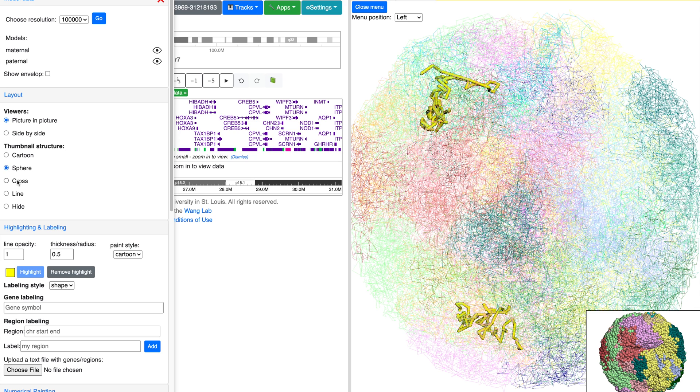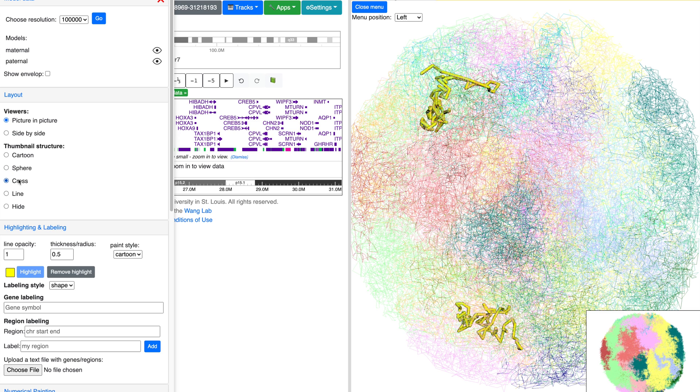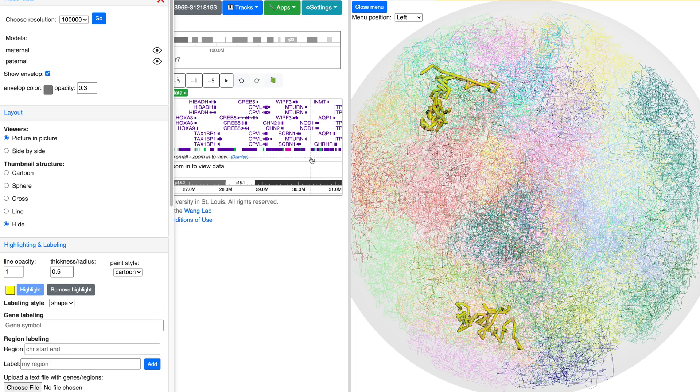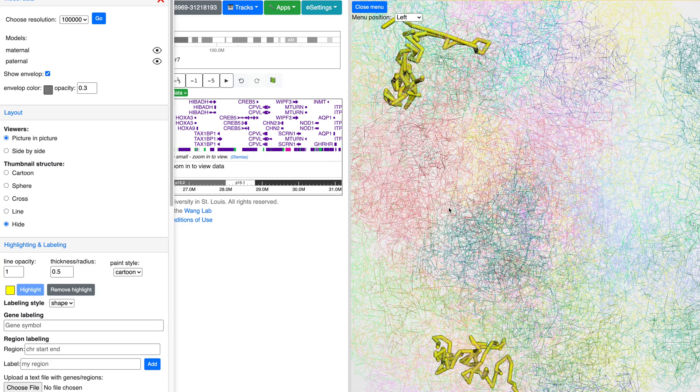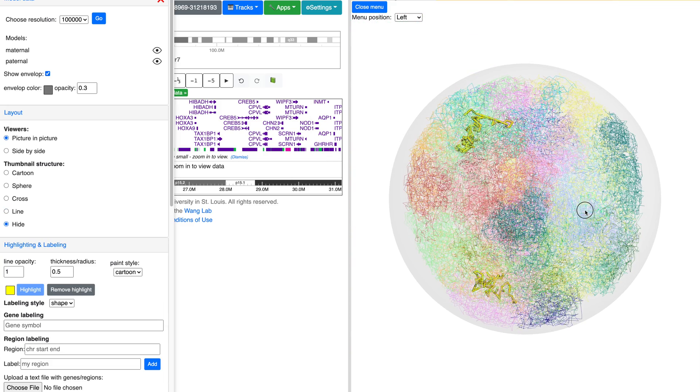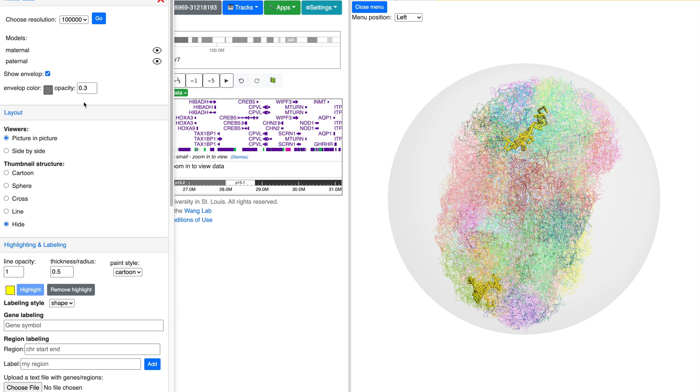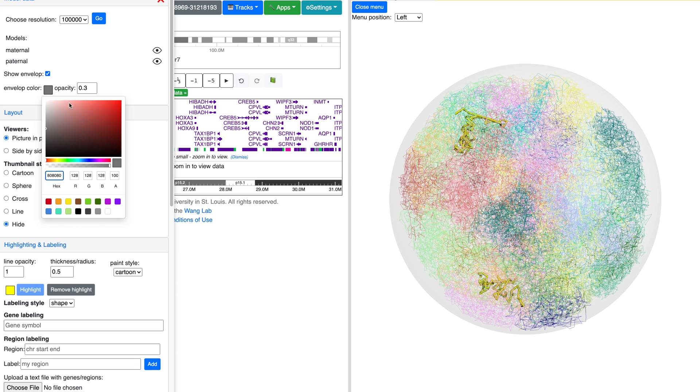The thumbnail structure options will allow you to change the view of the thumbnail. To show the envelope, select the box under the models. The below options will allow you to change both the color and the opacity of the envelope.